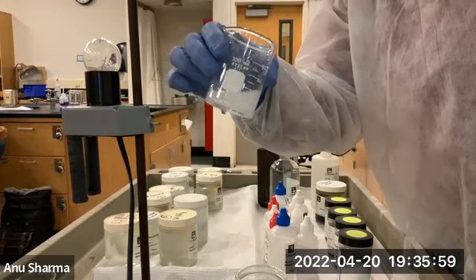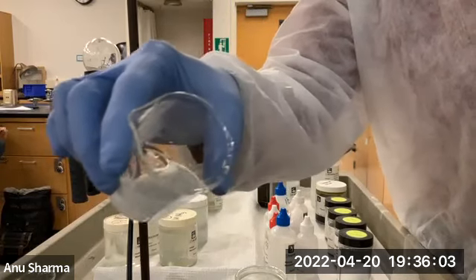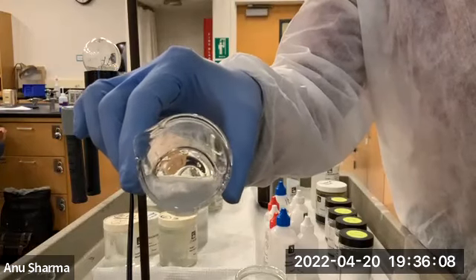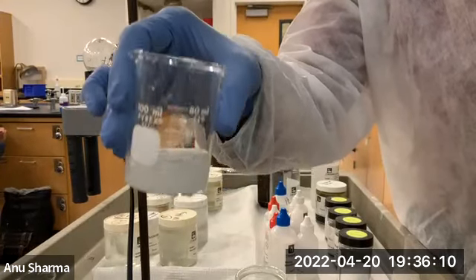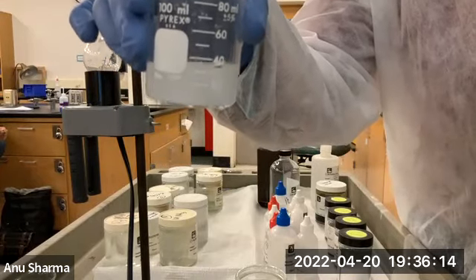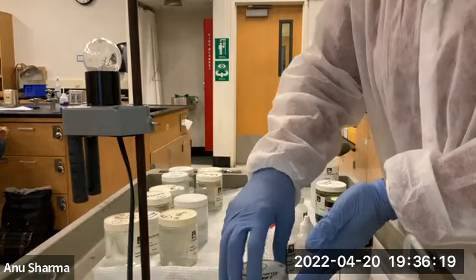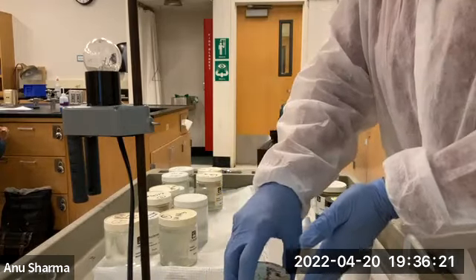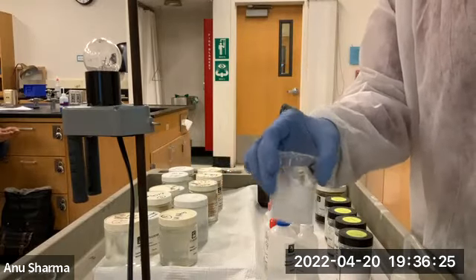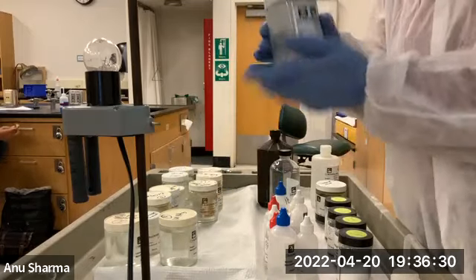What is formed here? What is formed? Come on. Barium hydroxide reacting with sulfuric acid. We covered this in the lecture. Come on, guys, check your lecture notes. Tell me.